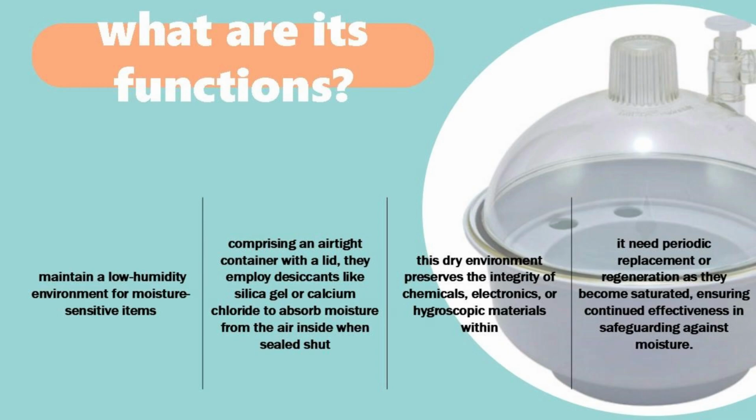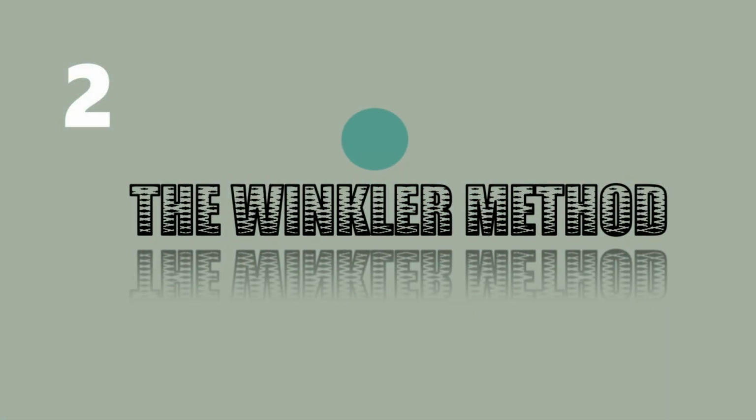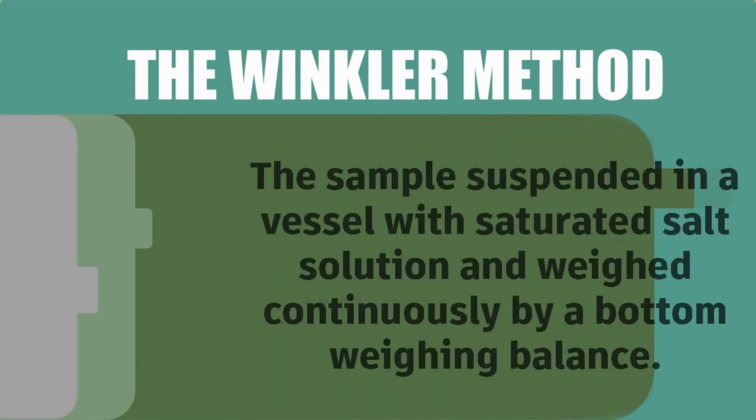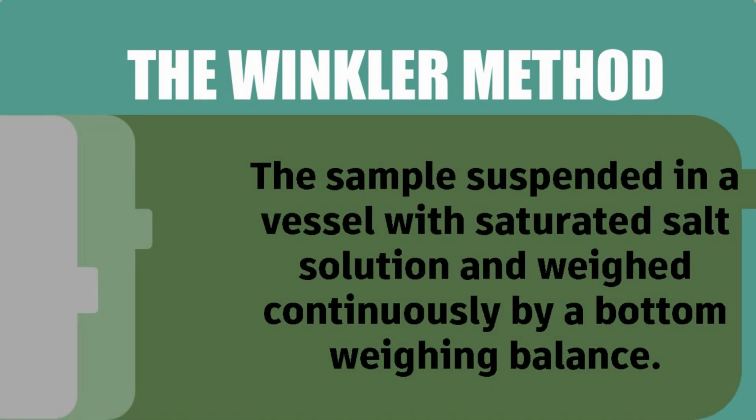This dry environment preserves the integrity of chemicals, electronics, or hygroscopic materials within. It needs periodic replacement or regeneration as the desiccants become saturated, ensuring continued effectiveness in safeguarding against moisture. Second, the Winkler method. The sample is suspended in a vessel with saturated salt solution and weighed continuously by a bottom weighing balance.